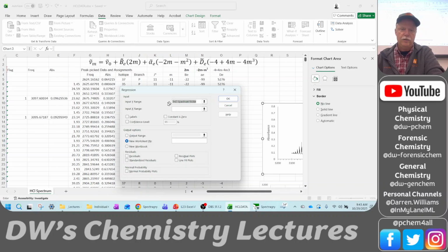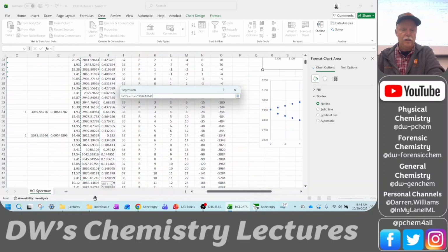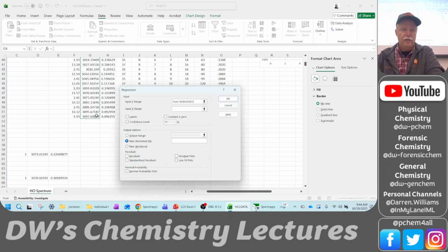Of course, Excel would not cooperate on days when I need it to cooperate. So we're going to have to do it just by dragging. We're going to just drag the whole thing right there. Okay, that's the Y range.